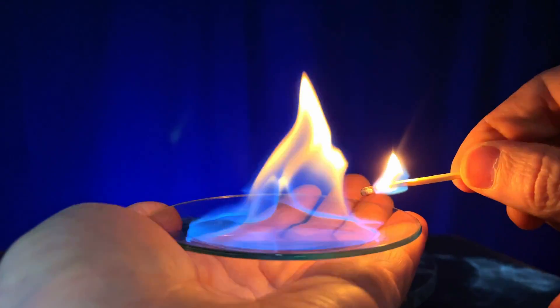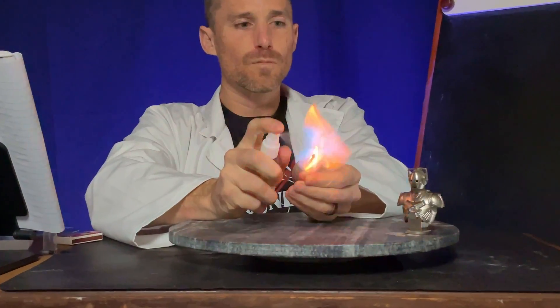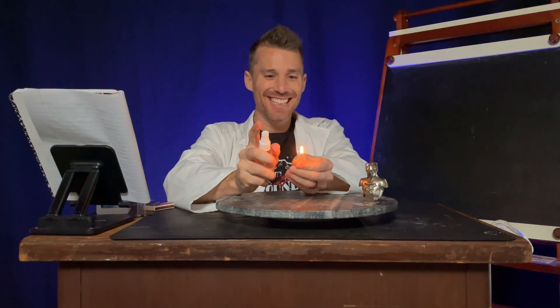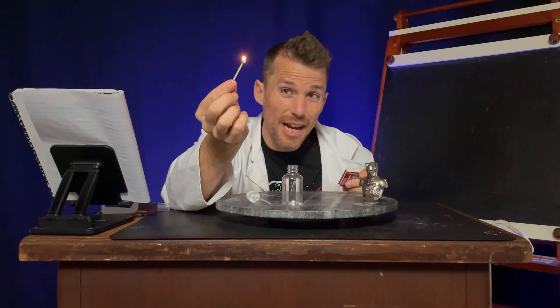This is highly flammable 91% isopropyl alcohol. This is a really challenging match. There it is. And this fireball shows just how flammable alcohol can be. My finger's on fire. So this should be really dangerous, right? Puts it right out.